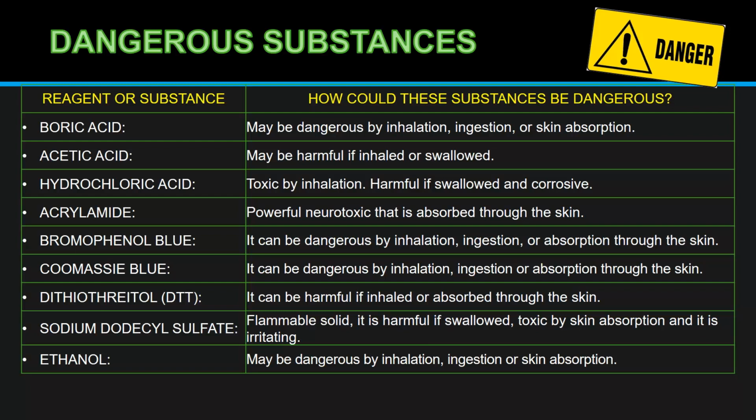Coomassie blue, it can be dangerous by inhalation, ingestion, or absorption through the skin. Dithiothreitol, it can be harmful if inhaled or absorbed through the skin. Sodium dodecyl sulfate, flammable solid, it is harmful if swallowed, toxic by skin absorption, and it's irritating. Ethanol may be dangerous by inhalation, ingestion, or skin absorption.